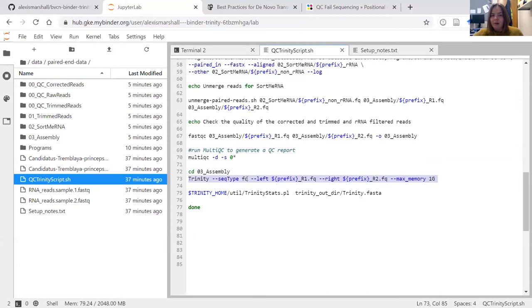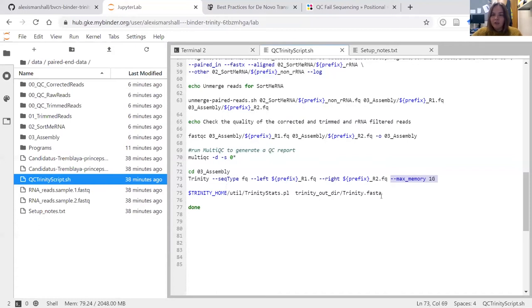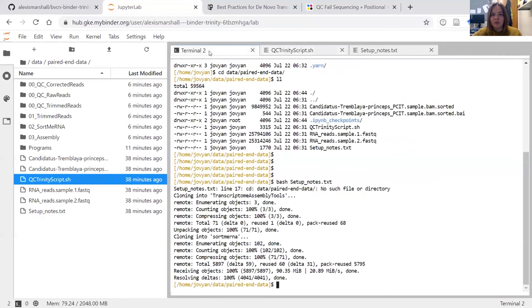Once MultiQC has run, we change into the assembly folder and run Trinity. Trinity here takes a FASTQ input, left reads, right reads, and we have a memory limit based on the Binder environment - this just ensures Trinity doesn't fail. Once Trinity has finished, we run the Trinity Stats Perl script, which tells us the average size of our assembled transcripts, and then it finishes.